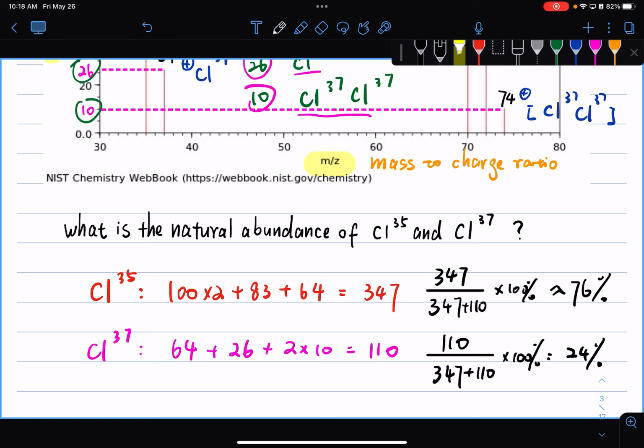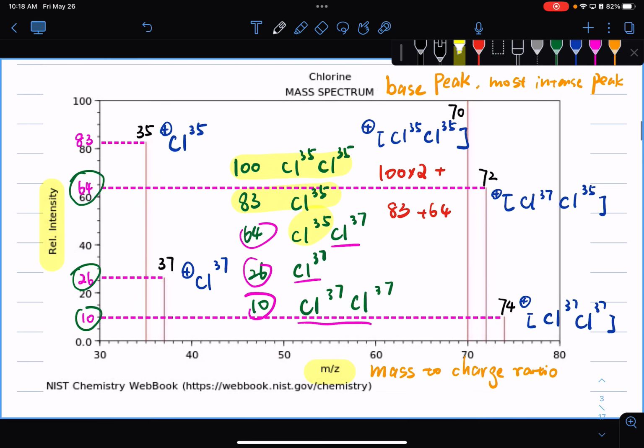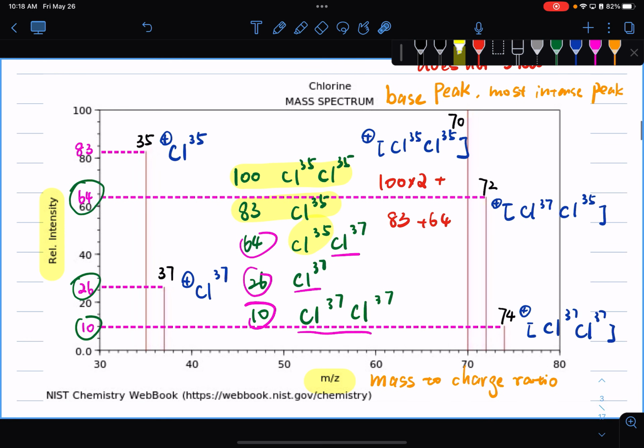And by looking at the time, we can derive what's the mass of each of those fragments. And using chlorine Cl2 as an example, we went over the information you can get by looking at the mass spectrometry. So in this case, we can get ideas like what's the relative natural abundance of isotopes?